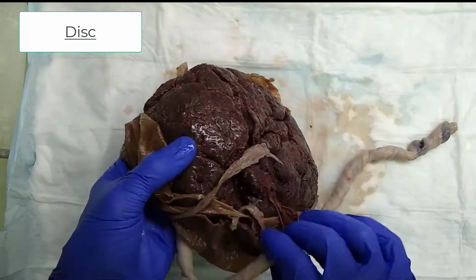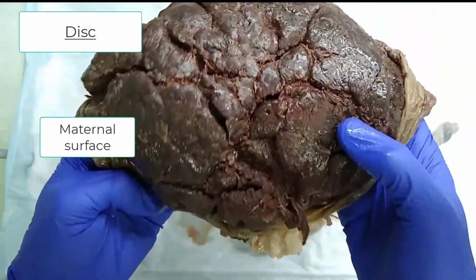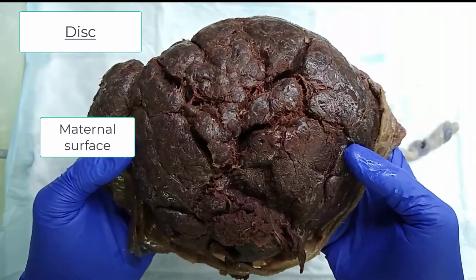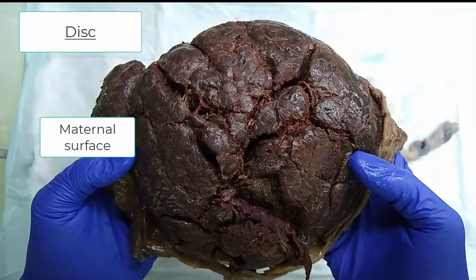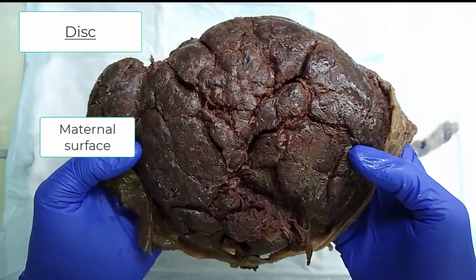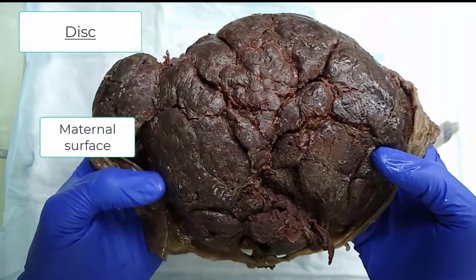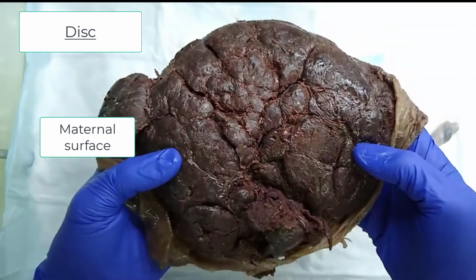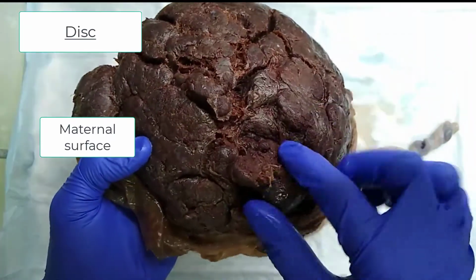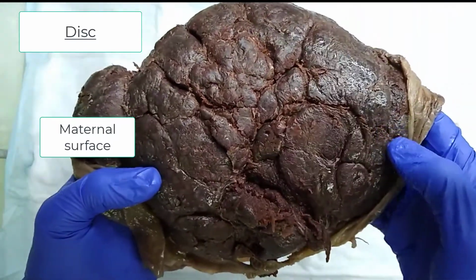The other side of the placenta is the maternal surface, which is attached to the uterine wall. And you may be able to see that if I bend it a bit, there appear to be areas where the parenchyma divides. And that roughly estimates the presence of cotyledons, which are the subdivisions of the parenchyma. Normally the parenchyma is complete when the placenta is taken out. This area here is a little bit disrupted, but appears to be a complete surface.